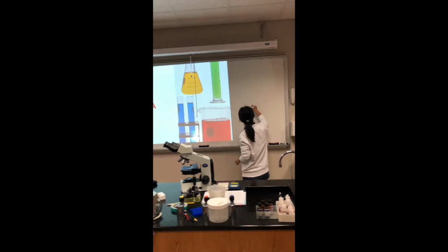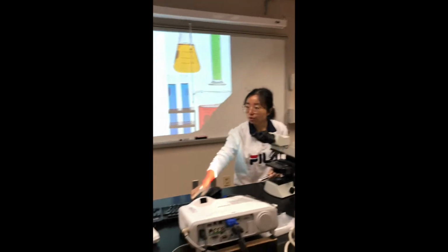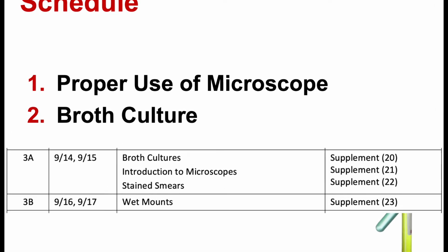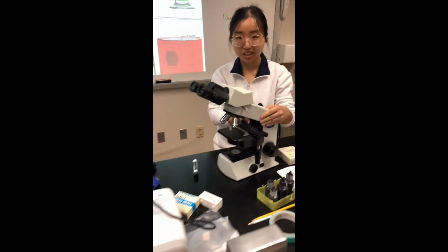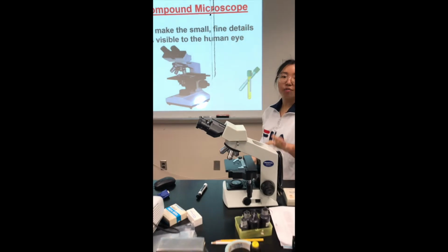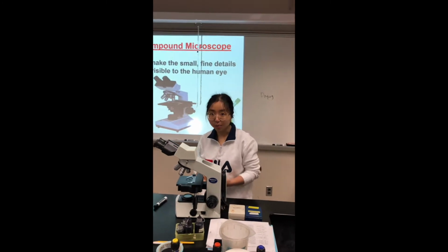Watching. And today we are going to introduce you to the proper use of a microscope. So let's have a look at our compound microscope here. This is a compound microscope. And the use of a microscope is to help you to see fine details of objects.